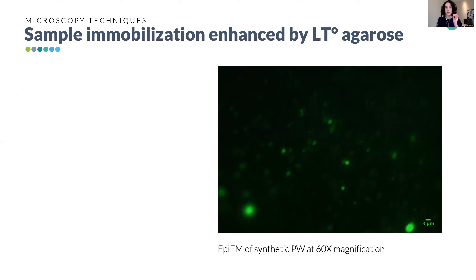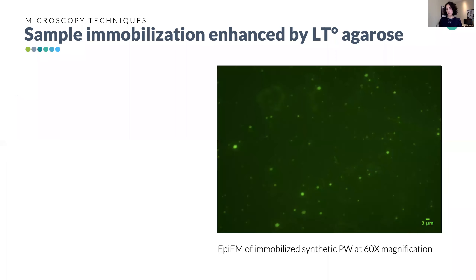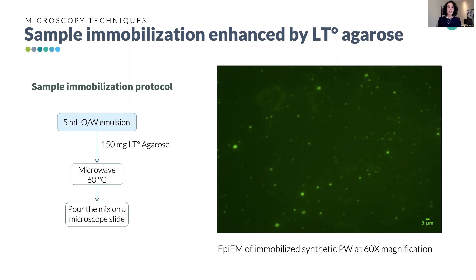For the first step — sample immobilization — if you put the liquid sample as-is in the microscope, it looks blurry because of Brownian motion and we cannot use those images. After many trials, the best protocol we found was gelling the emulsion with low-temperature agarose. This creates a very thin layer of gel on the microscope slide which can be stored in a freezer for weeks to be analyzed. After immobilization the image shows much better contrast.